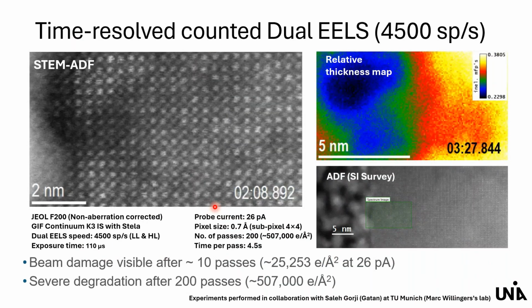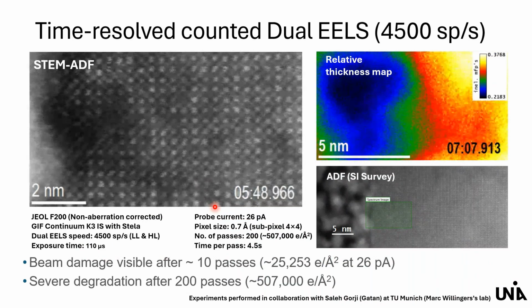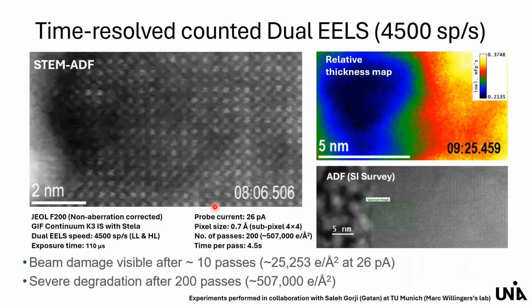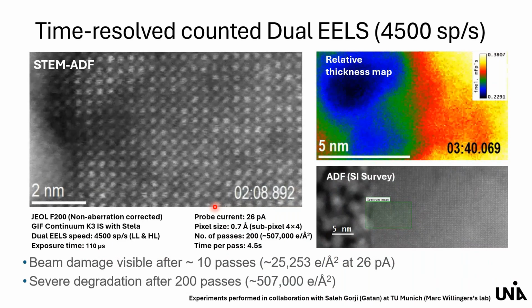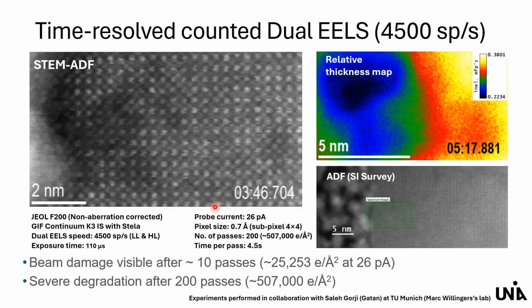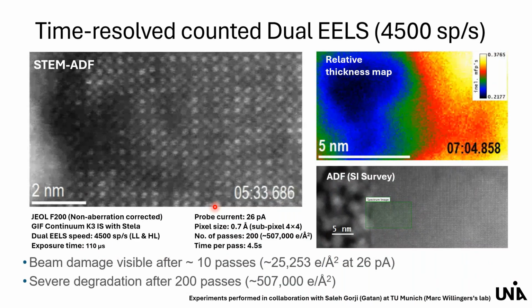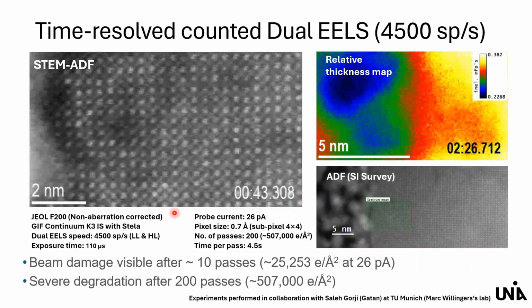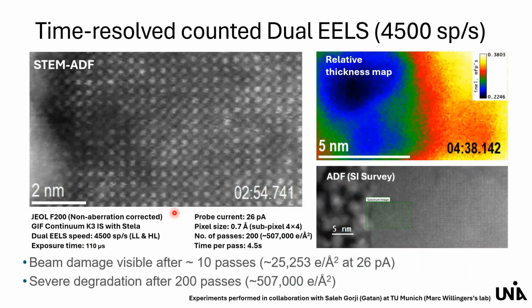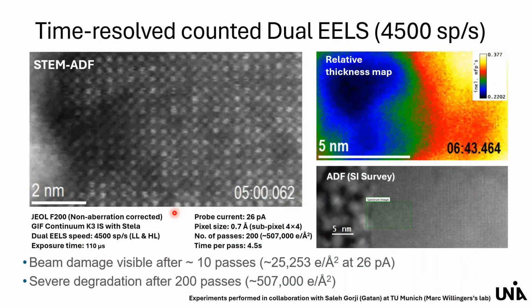So by adding up, you get then also finally a good result. But you have to add up several images to get enough signal. But in between all these frames, you can apply a continuous drift correction. So this compensates for the drift between the passes.